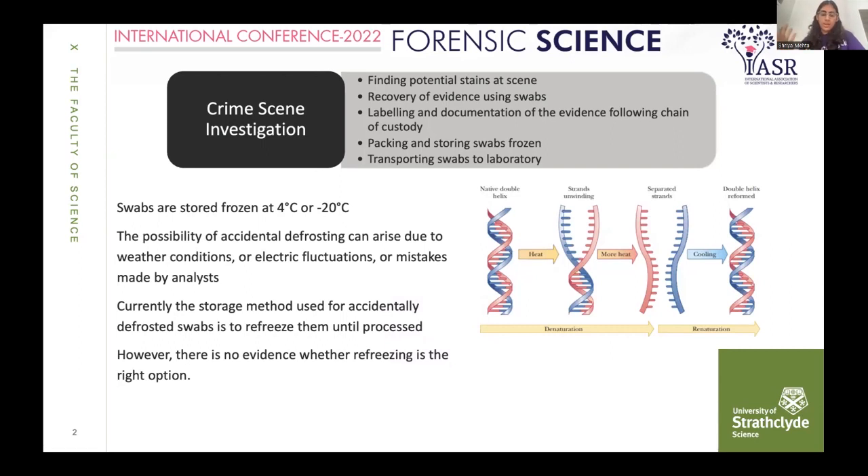More heat can degrade the DNA. Biochemically, it is proven that if we cool the DNA, it can lead to renaturation. This is just the biochemical process of how heat and cooling effects on DNA can lead to denaturation and renaturation. Accidental defrosting can arise due to weather conditions — very common in India, especially during summers, as India is a tropical country — or due to electrical fluctuation, or simply mistakes made by analysts.